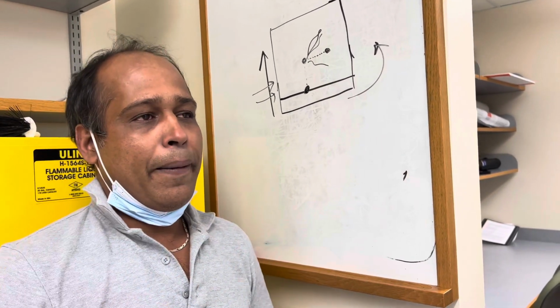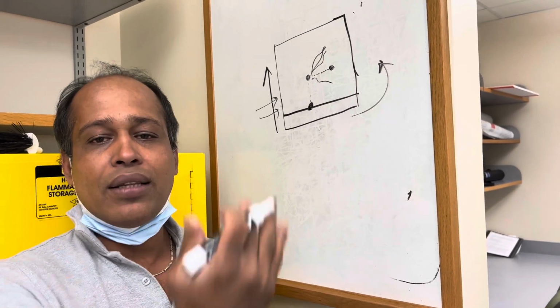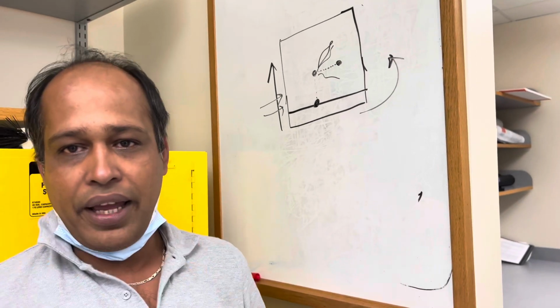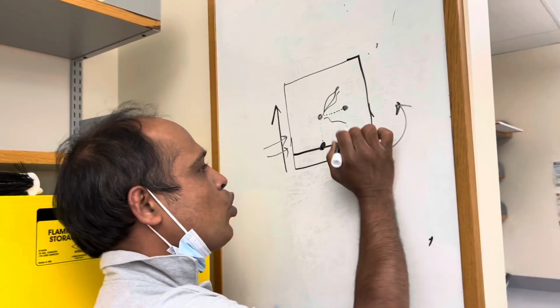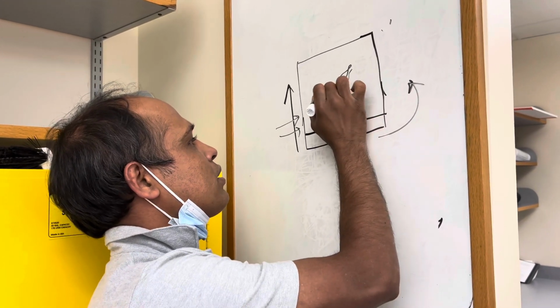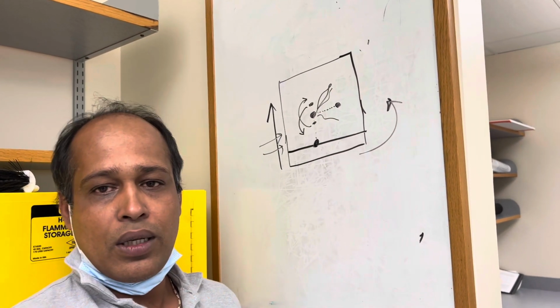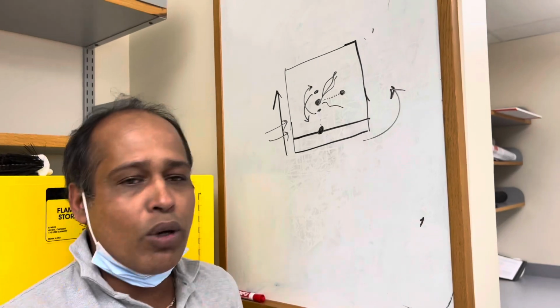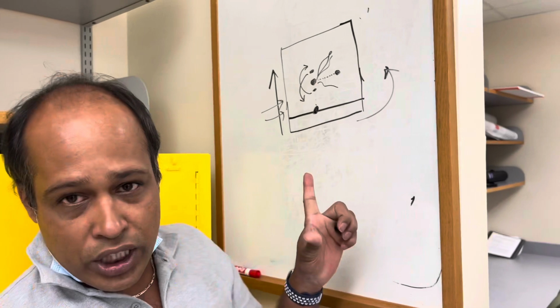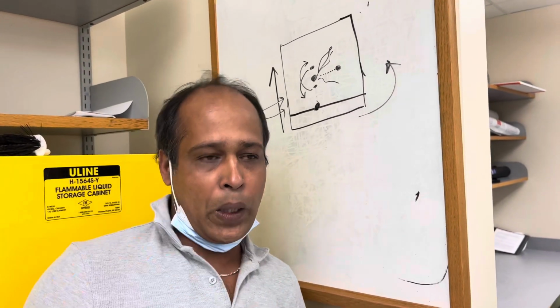If you add only hexane, sometimes some other impurity can come first. It changes the things. Suppose with 2% ethyl acetate your compound is moving here, and there may be some impurity here, and these can switch. I have seen that many times with only hexane. So you have to play around before setting the column. So do the 2D TLC and run the TLC in different compositions of the solvent.